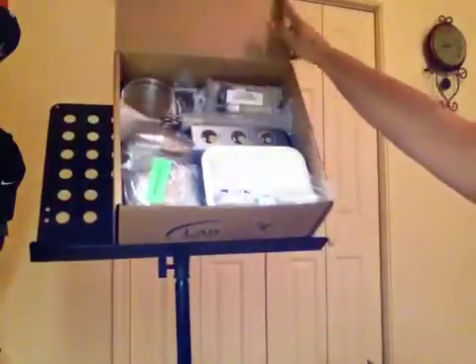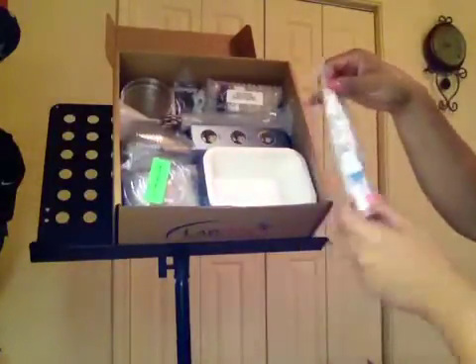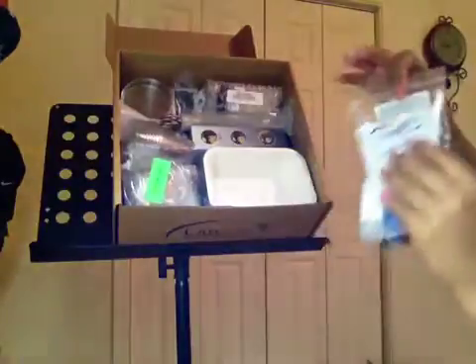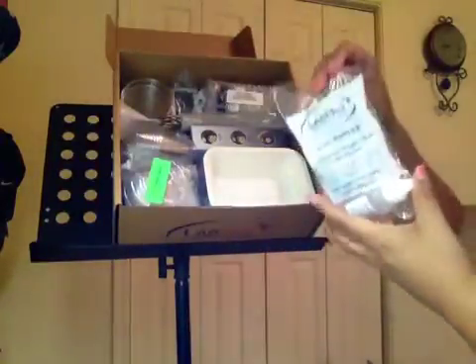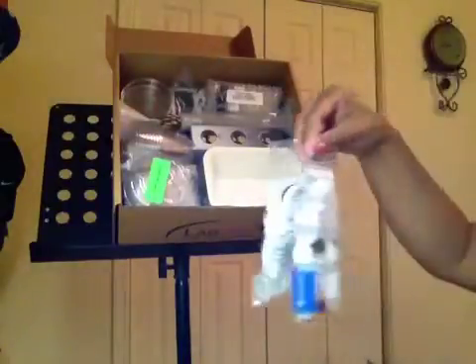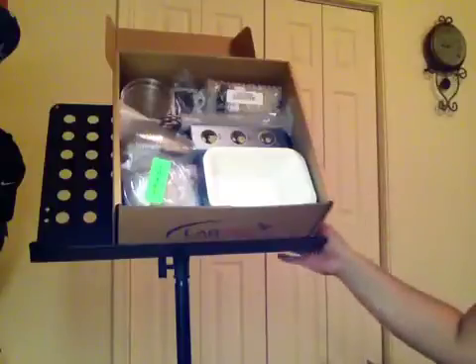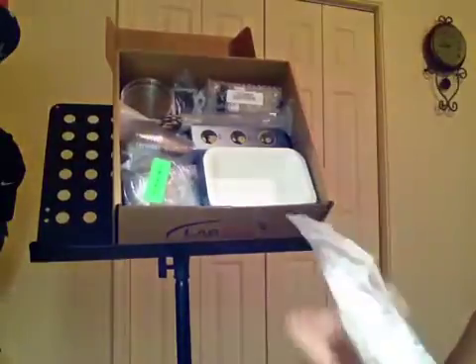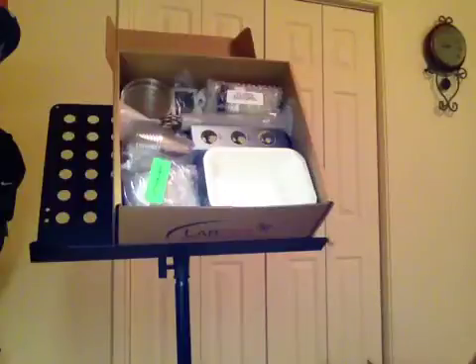Here's what you're going to see when you open your kit. Inside you're going to have various little packages of bottles with different colored chemicals — in fact there's going to be about four of these, and they're all going to be labeled, for example, cell membrane transport, macromolecules of life, and gram stain kit. All of these chemicals are safe to store at room temperature — there's no reason to put them in the refrigerator. But you do need to make sure you keep them out of reach of small children. The chemicals are in very small quantities and are not dangerous in the quantities sent, but we still want to minimize any risk to your household members.